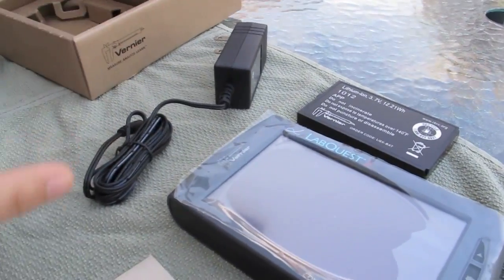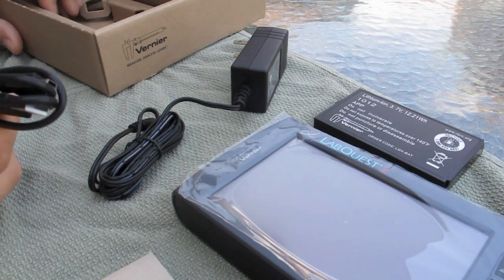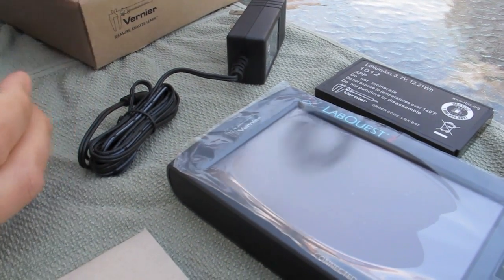And then we got our power charger. Will it just run with power if the battery's dead, like Logger Pro? Yeah, I imagine it will. And we got ourselves a standard USB cable — got tons of those.